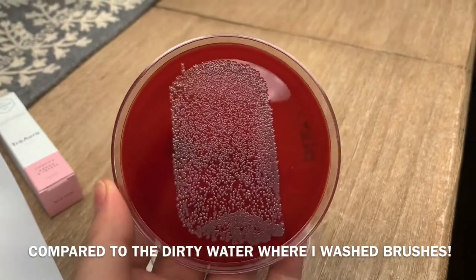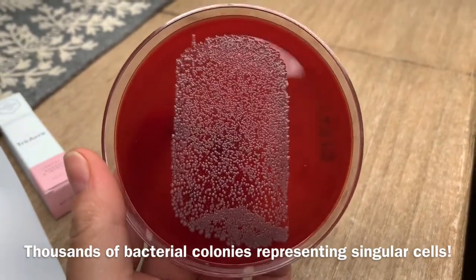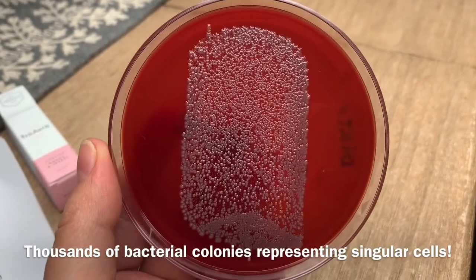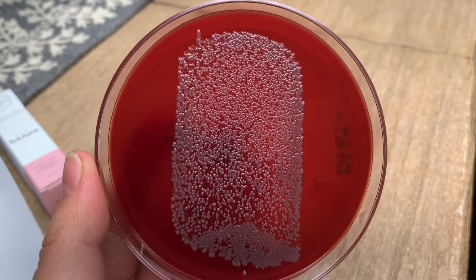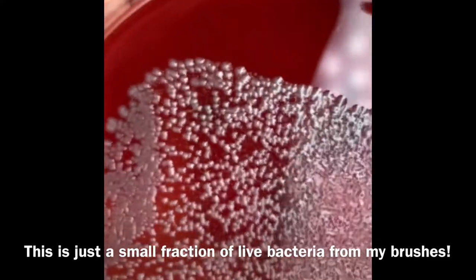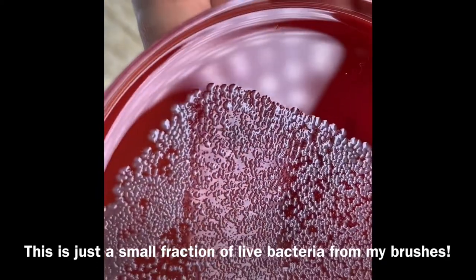This is what you would get if you don't clean your brushes on a regular basis. Basically if I hadn't cleaned them, then the next day I would be reapplying this number of bugs back onto my face. If your skin is healthy overall and you have a balanced microbiome, it might not be very critical. However, you would still want to clean your brushes on a regular basis. Each dot represents one colony, and the smell — I cannot really explain it, but it doesn't smell nice.